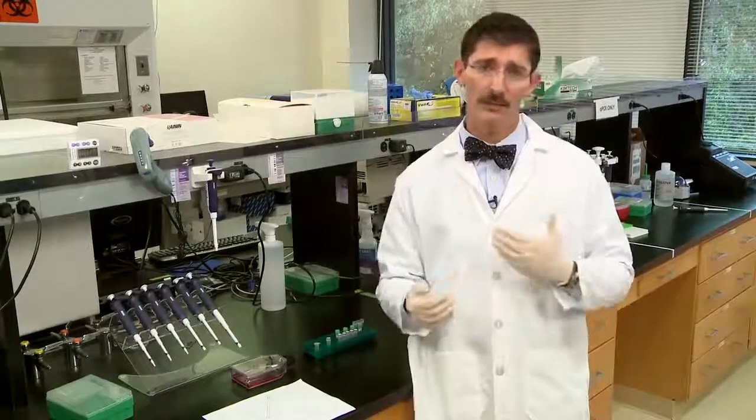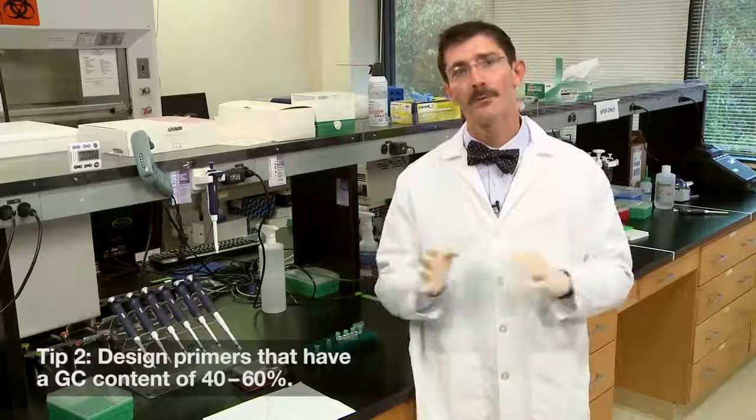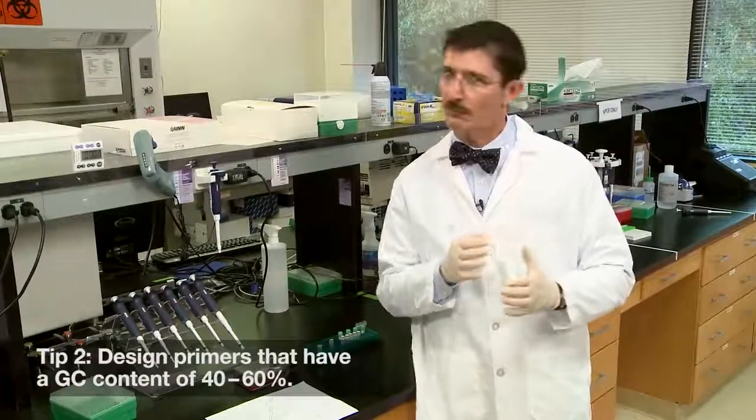If you're working with degraded samples, however, you may have to settle for that shorter amplicon. Tip number two: design primers that have a GC content between 40 and 60 percent.